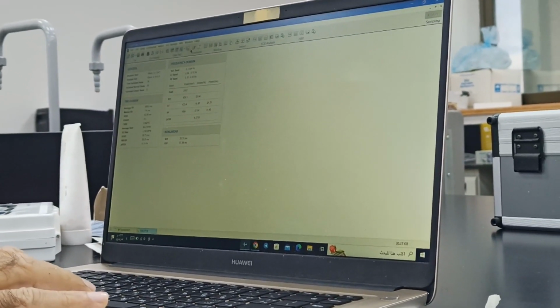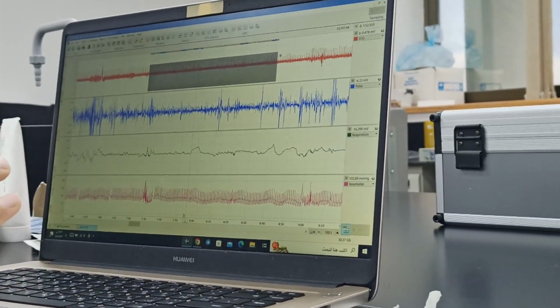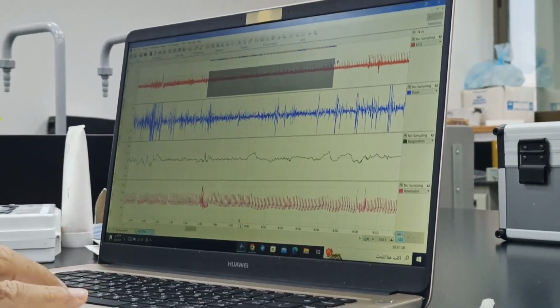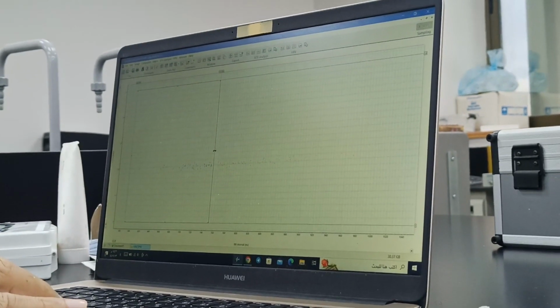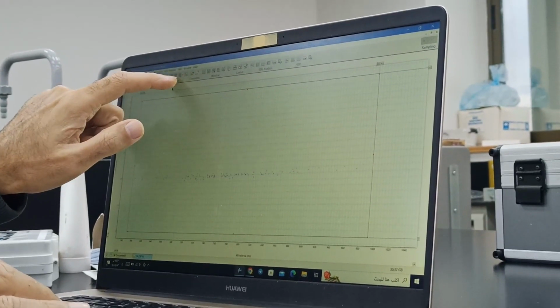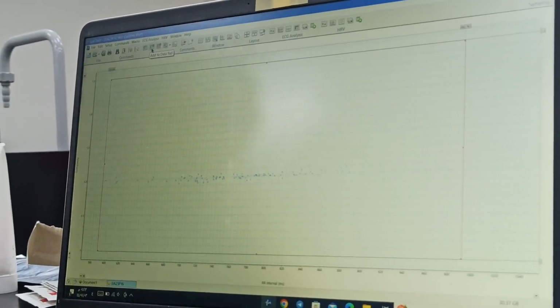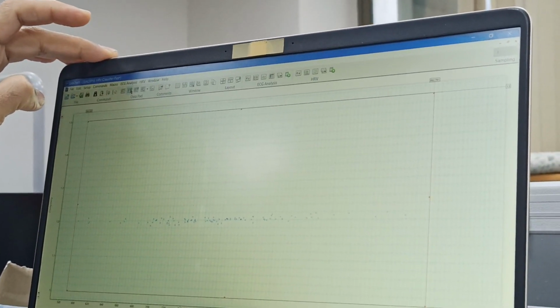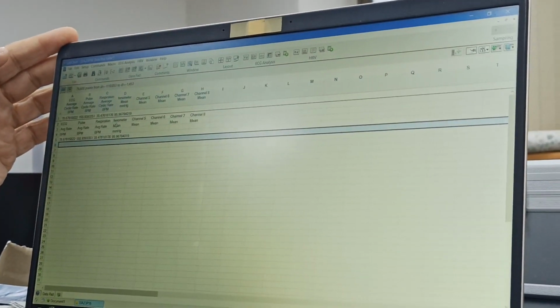Now, the next thing would be that we can develop a file. Say, for example, all this data. Sorry, I will first increase this. This is a data pad, and we have a command add to data pad. Whatever calculations are there can be added and seen here.